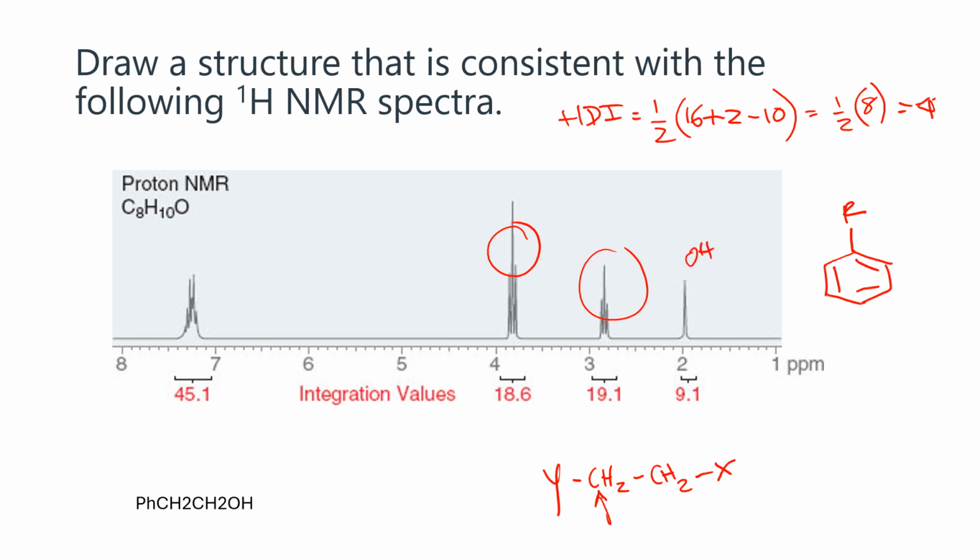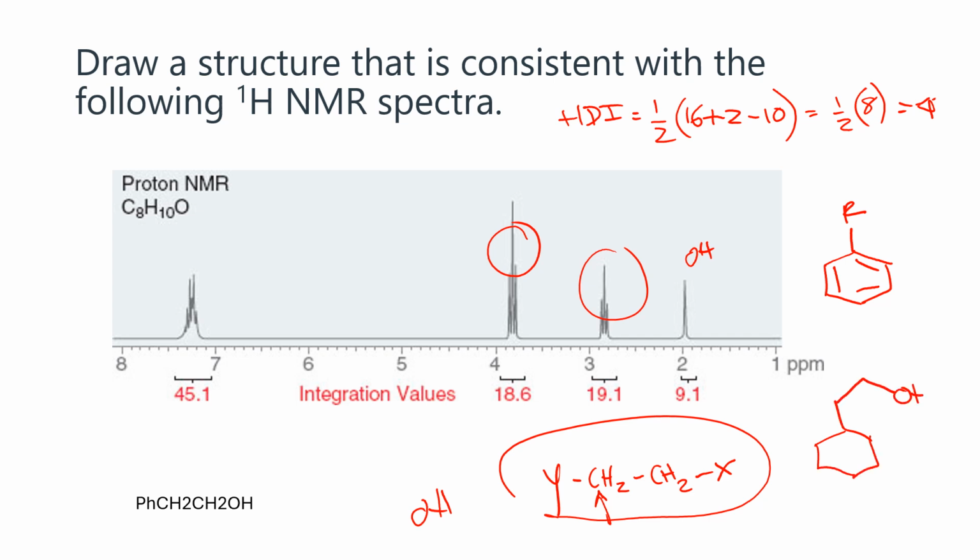So putting those pieces together, this pattern, this and that, my compound is the following. This. Okay.